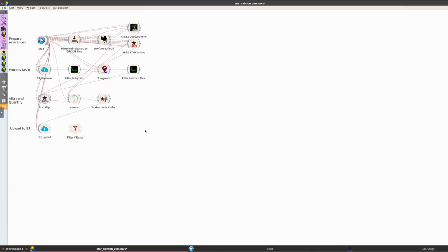After running STAR align, you'll get a bunch of output files. Most importantly, the aligned BAM files and STAR's version of gene expression count files. In the next step, Salmon is used to quantify gene expression from the BAM files, and it uses the transcriptome and annotation files generated earlier. As outputs, each BAM file will have its gene and transcript quant files generated separately. The last step is to combine the quant files obtained from Salmon for all samples and create a tidy spreadsheet with all genes and transcript quantification listed for all the samples.